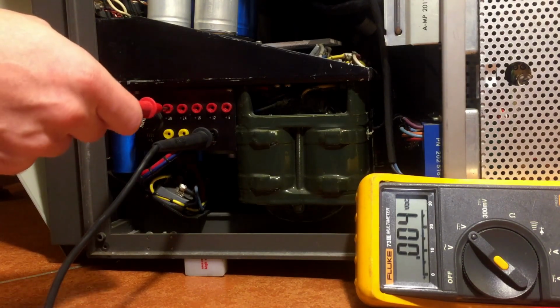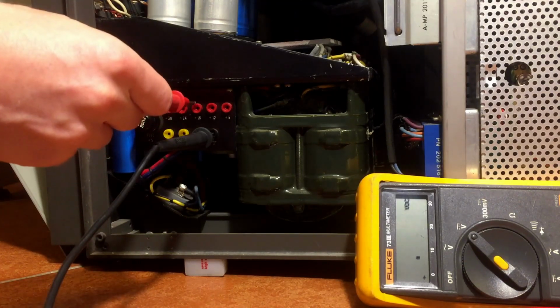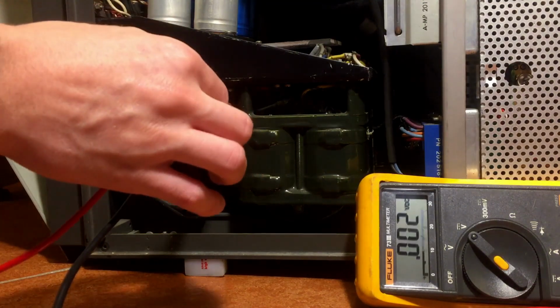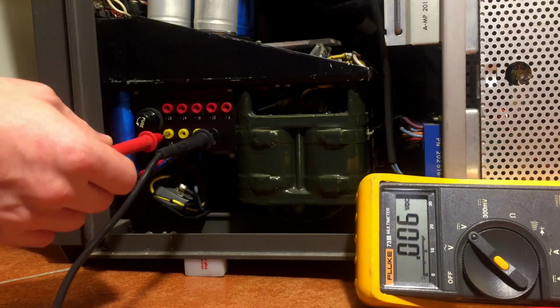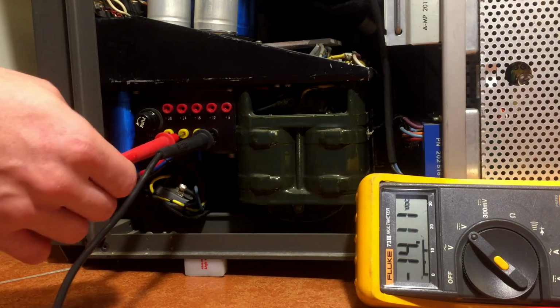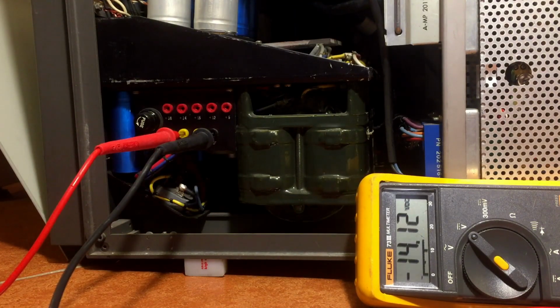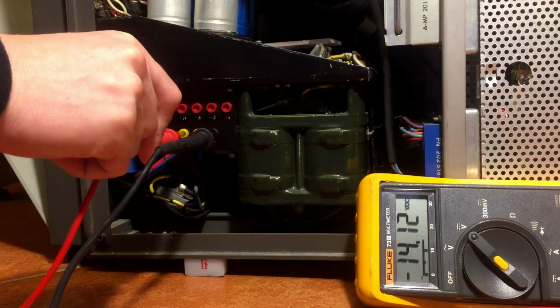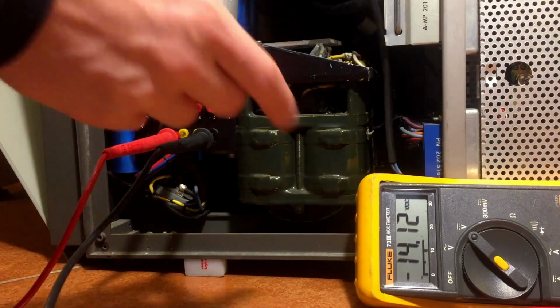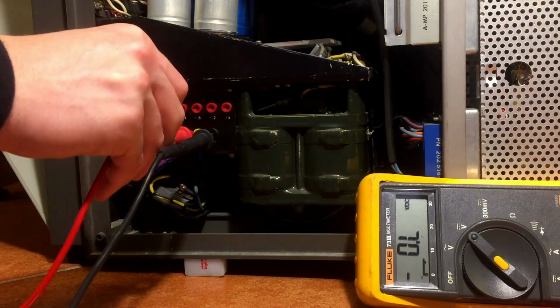So this should be 36 volts, and yes, it's kind of there. 24, yeah, plus 15, yeah, plus 12, oh yeah, plus 5. Yeah, it's perfect. Minus 24. Yeah, minus 12. Yes, it's a little bit low, but you know, minus 14. Jeez, it's more than 2 volts lower than it should be. So there might be something wrong here. Perhaps something disconnected. I don't know. Perhaps it's not properly loaded up, and so it's a little bit lower. I don't know. It's minus 6.